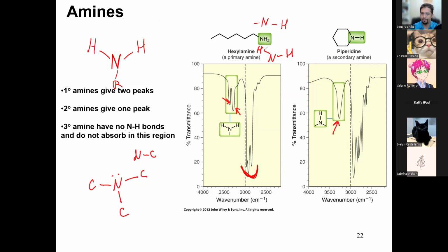Yes, yes. And be careful, right? Is there a defined range for the amines? I would say between like 3100 and 3400. But this is also the same region as alcohols. So if you have a compound that has an amine and an alcohol, the alcohol signal might just drown out the amine signal. So you don't always see them even though you expect them to be there, right? So it really does depend on what type of molecule you have.